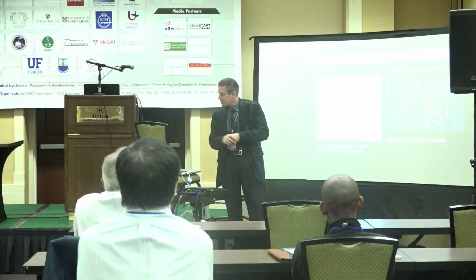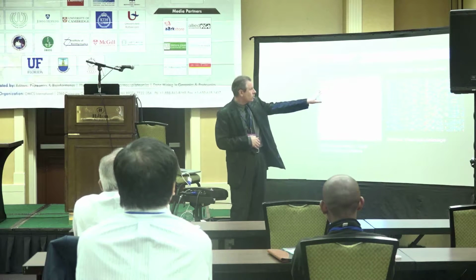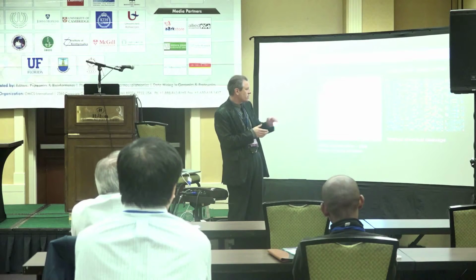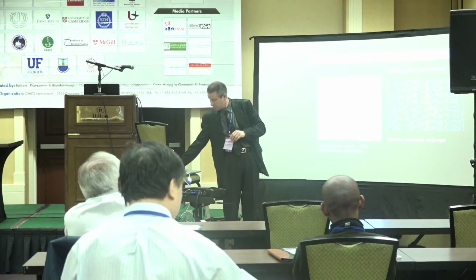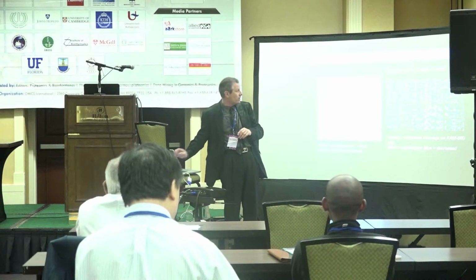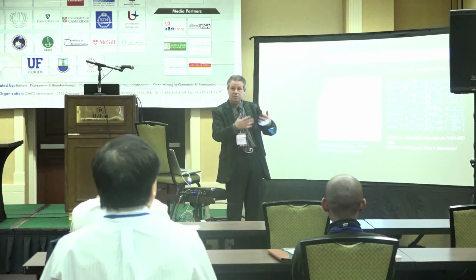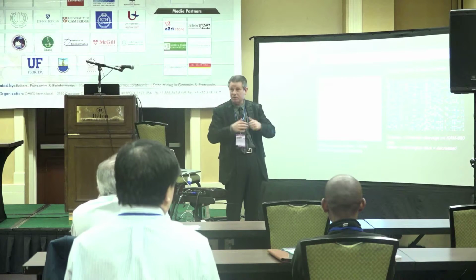In this configuration, here we can see the effect of chemical cleavage. Here's what it looks like from A431 cells using the standard technique without chemical cleavage. If we do the chemical cleavage, you'll notice the spots are dramatically reduced. In fact, if we overlay the two, everything that's blue is where the signal intensity has been decreased because the chemical cleavage has resulted in loss of those signals.